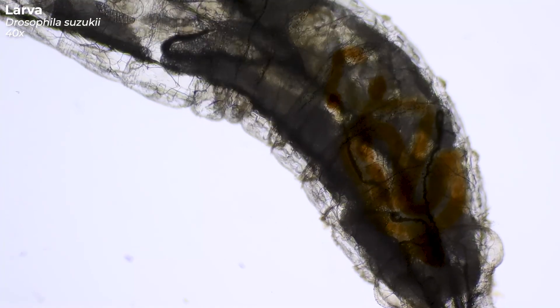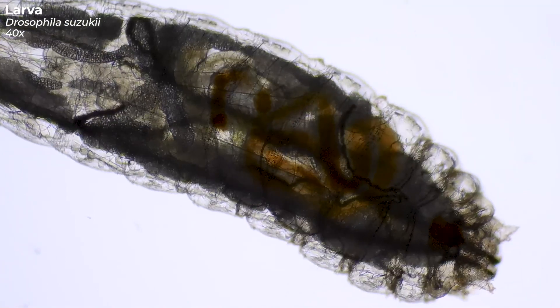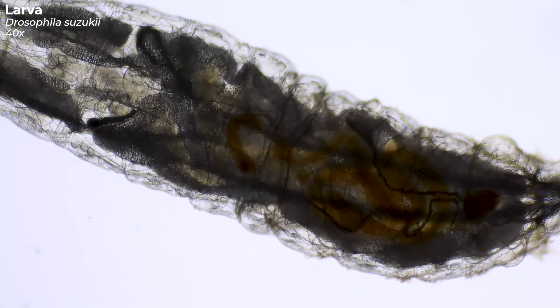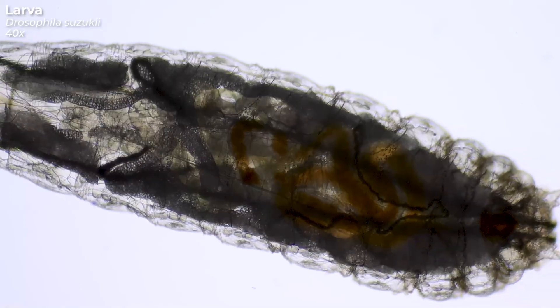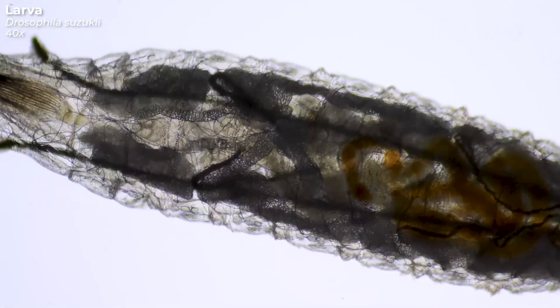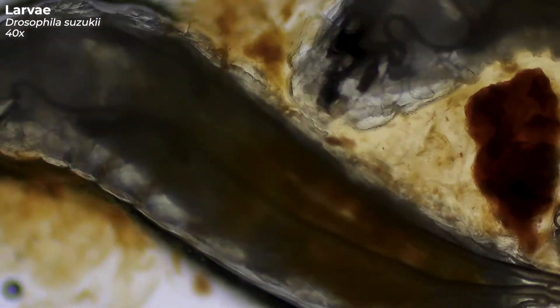The eggs of the fly are laid in ripening and ripe fruit. To do this, the female carves a hole in the intact skin of the fruit with her saw-like ovipositor. She then lays up to three eggs in this hole. And from these eggs hatch these creatures that we can now observe fighting over the food. One female can lay 300 to 400 eggs in her lifetime.